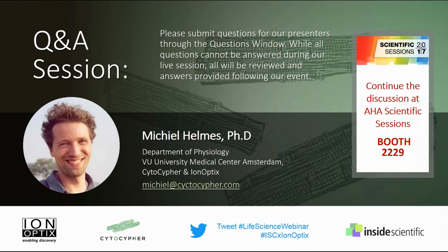How could these studies using the high throughput system be used? In your opinion, maybe Michael, you could start. How do you envision this system supporting cardiac safety studies? We have to make a serious effort in the ability to support measuring as many compounds as possible, so you can repeat the testing on multiple compounds. Let me rephrase it slightly. What you can't get away from with high throughput is that you still need to measure from a number of animals or a number of preparations.